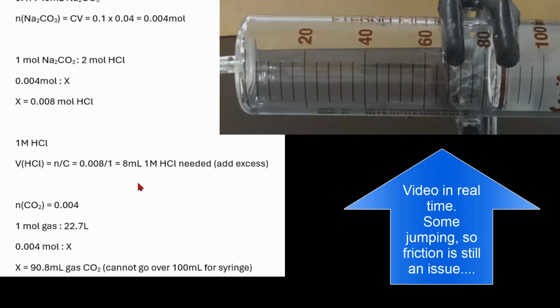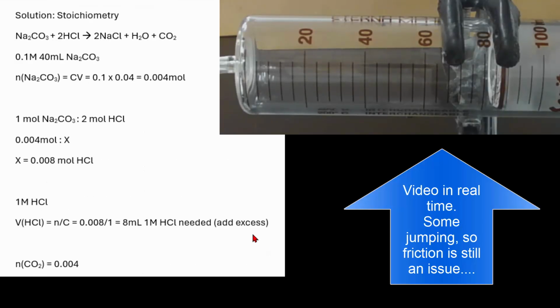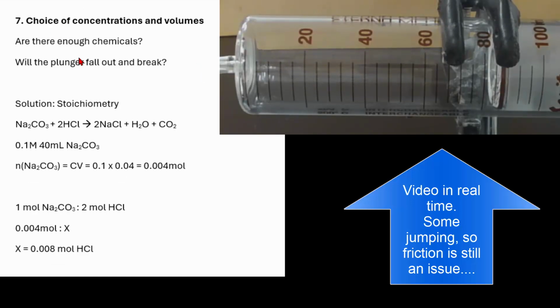I could have just released 20 mils, and then another 20 mils, and another 20 mils. So I could do many experiments without touching the top part of the system. And so I needed 8 mils, and I was delivering 20 mils, if you're wondering what I've been doing this video. And so I was expecting that it won't go over 100 mils, and so the syringe is also safe.